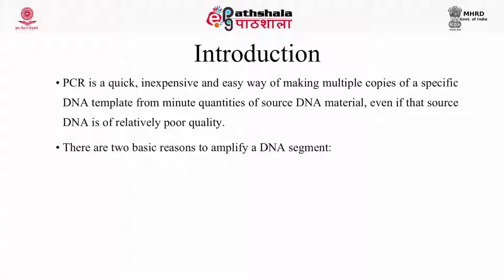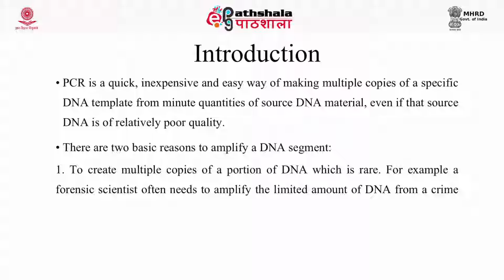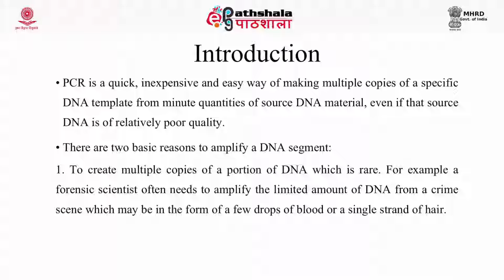There are 2 basic reasons to amplify a DNA segment. The first is to create multiple copies of rare DNA. Now, what is rare DNA? Let's take an example of a forensic science scenario in which we have evidence as a single drop of blood or a single hair. In order to help in the criminal investigations, we need to amplify this small amount of DNA from a small hair or a drop of blood, and in this, PCR is a useful technique.